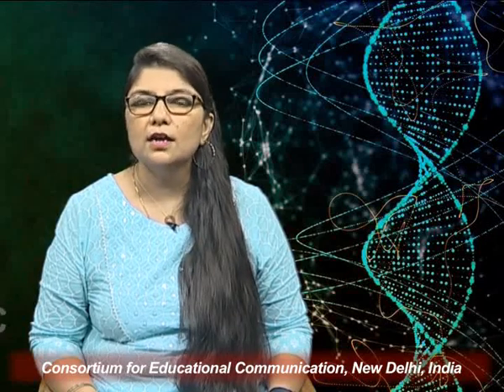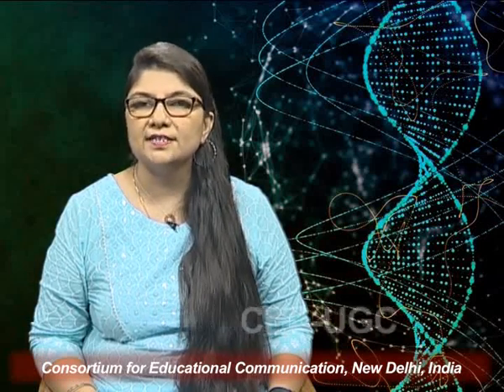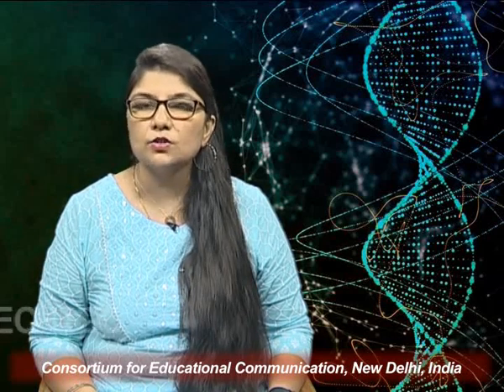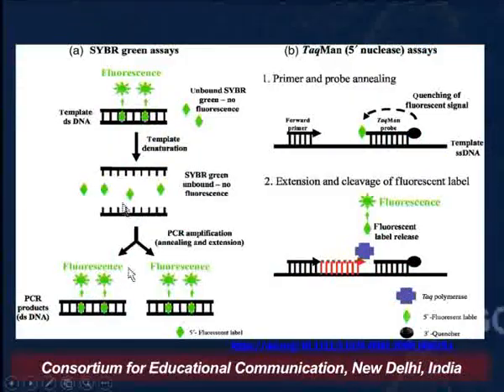In a similar way, a more sensitive dye such as the SYBR Green dye is used, which basically binds to the double-stranded DNA, and it can fluoresce only when it is bound to the DNA. On the left hand side, the method is shown here. You can see these dye molecules intercalate between the double-stranded DNA molecules. They fluoresce only when they are between the double-stranded DNA molecules. They do not produce any fluorescence when they are in the solution with single-stranded DNA molecules.